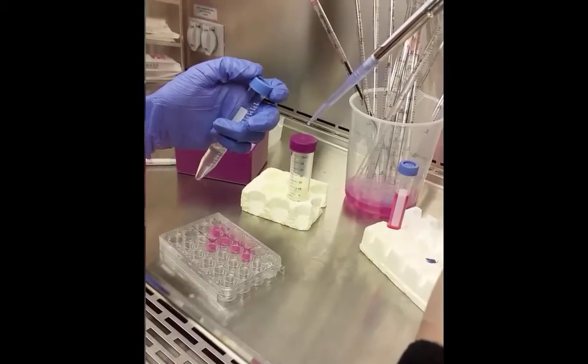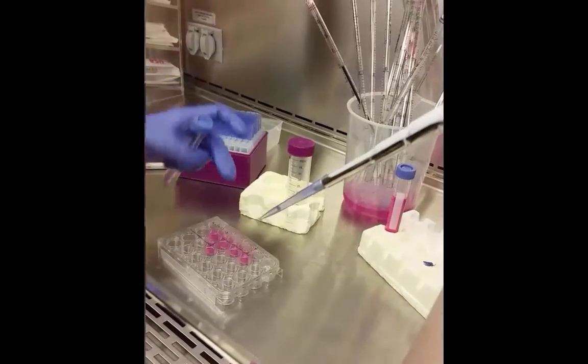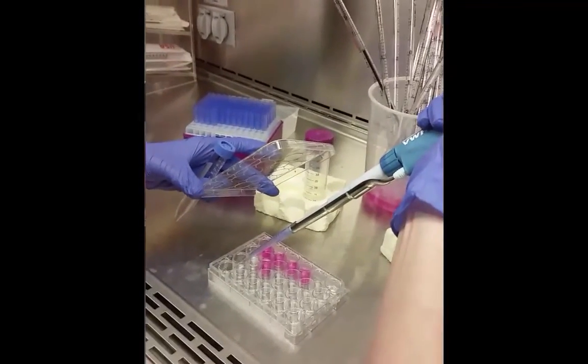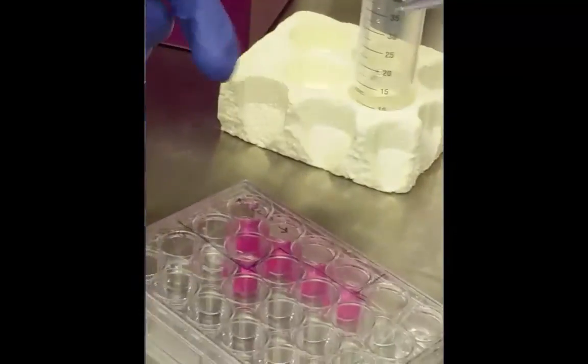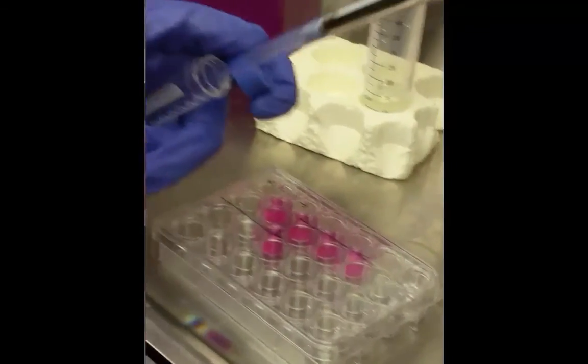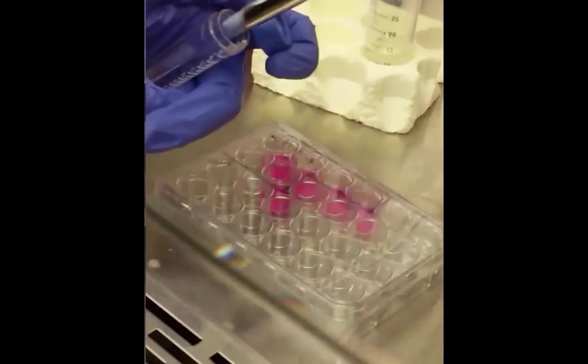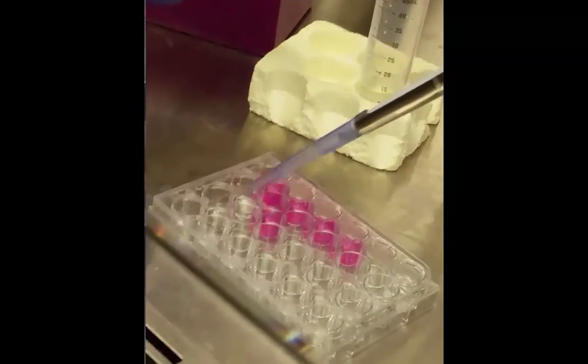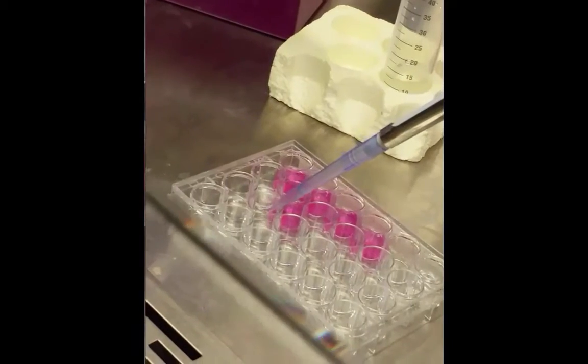You'll aspirate up 300 microliters. And with your free hand, you'll open the well plate and drop the alginate solution slowly in the bottom of the well. Remembering that there are cells in the suspension, so you want to do everything as slowly, carefully, and deliberately as possible.